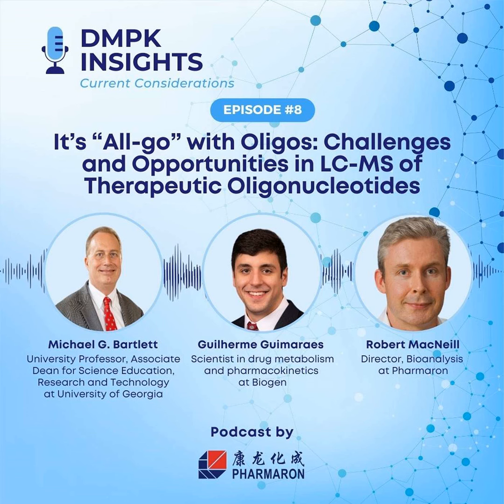Now, I would just like to say, I think we're in an interesting time. It's very exciting to see your paper coming along a few years back, showing how HILIC methods for oligos do belong in a BA setting, and so I think the field is definitely catching up to the advantages of HILIC. Again, at ASMS, we saw the amount of work being done highlighting HILIC workflows, and so I'm very excited for the new studies to come, new research opportunities in the area.